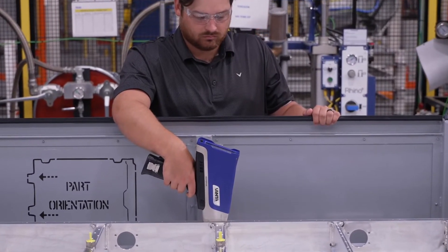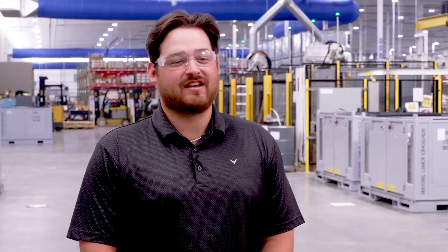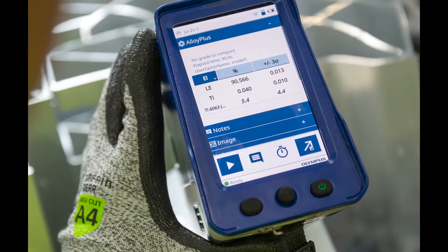When we're testing with the Vanta, we're looking at just titanium or silicon depending on the process. Two of the processes here at Dura check for the titanium layer and one process checks for the silicon layer. For the titanium layer we're looking for a range between 5 to 15 milligrams per meter squared. For the silicon process we're looking for a minimum of 350 nanometers of silicon applied.